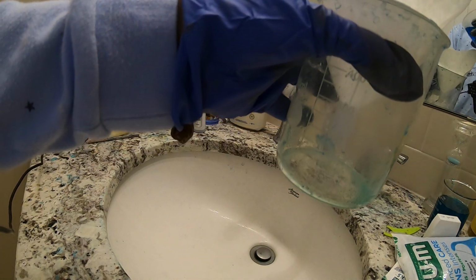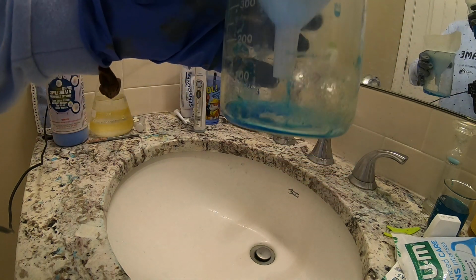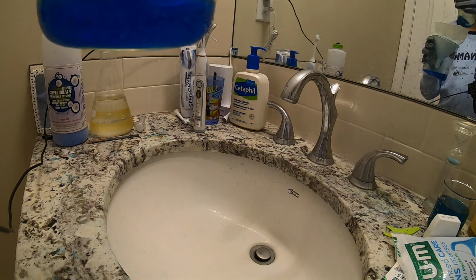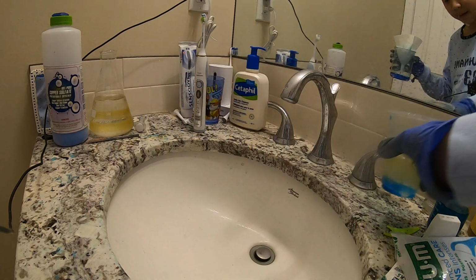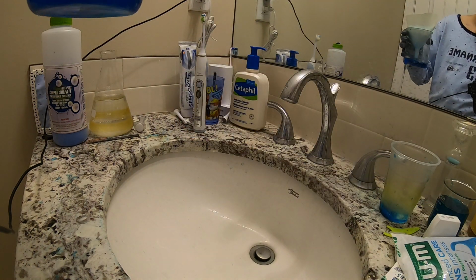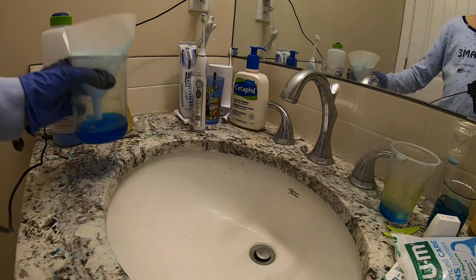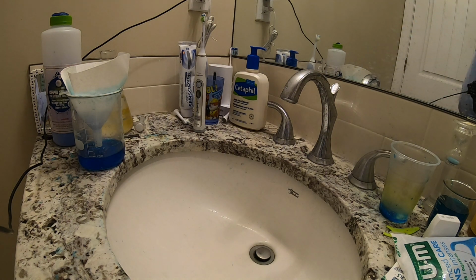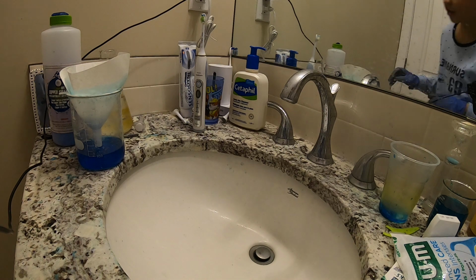And I'm going to pour the solution slowly. That's all. So that one is set aside. And while I set that there to completely drip down, I want to tell you that because I got my new whiteboard all set, the eraser and pens are all done, and I finished cleaning it. So I'm going to use that as my explanation for how copper sulfate can be used to make crystals.